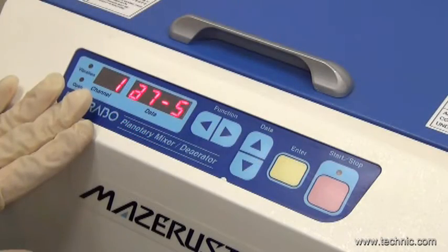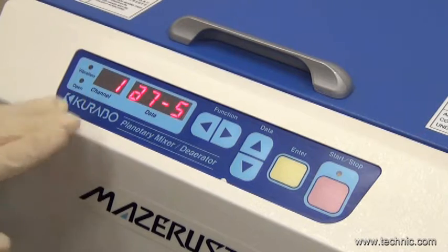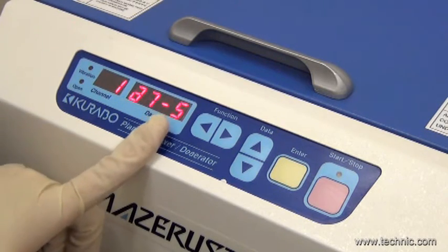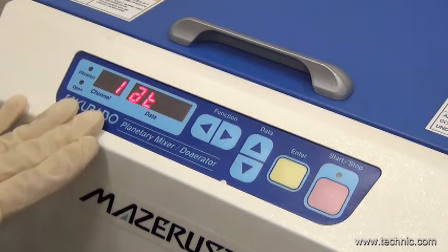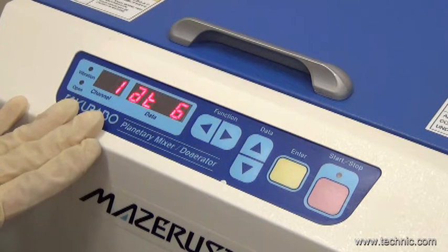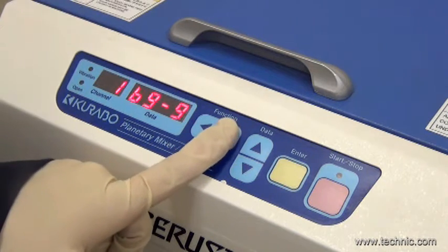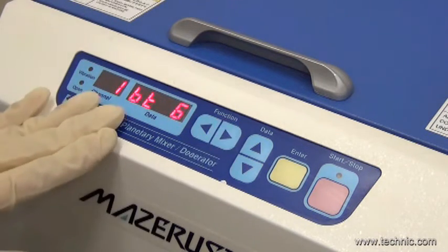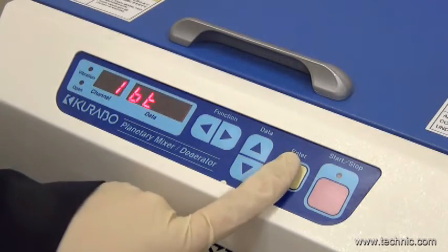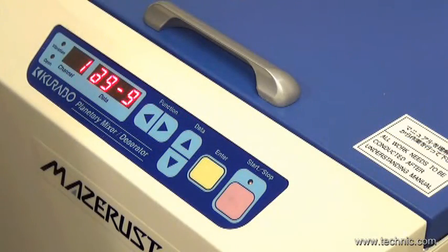Then, we will program the mixing speeds and time. For step A, the revolution speed is 7 and rotation speed is 5 for 1 minute. For step B, we have set the revolution and rotation speeds at 9, which is full speed, for 1 minute. Then all we need to do is press start.